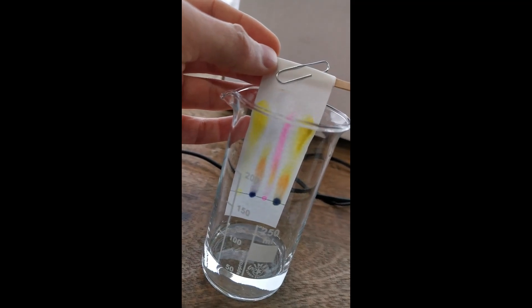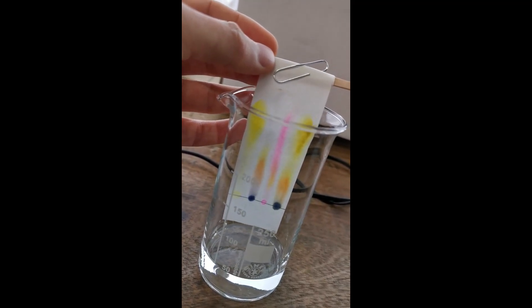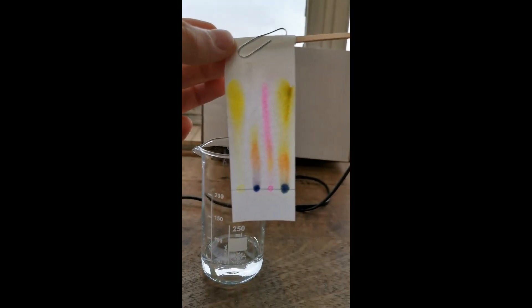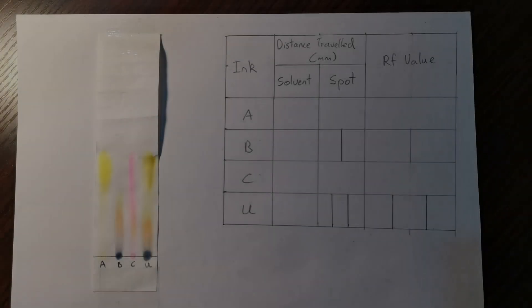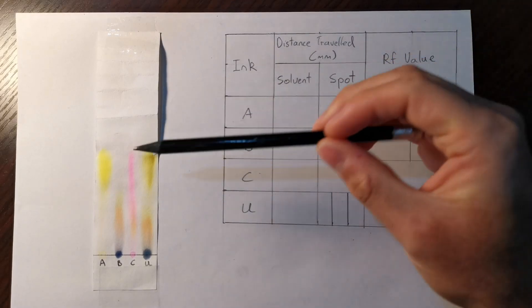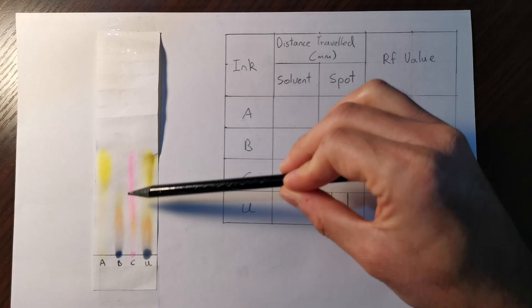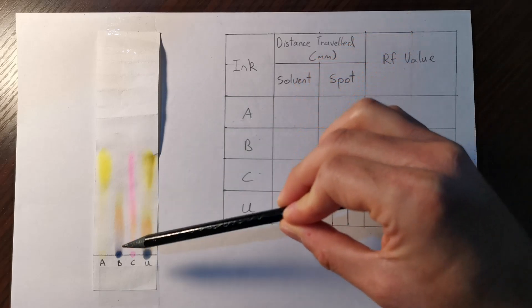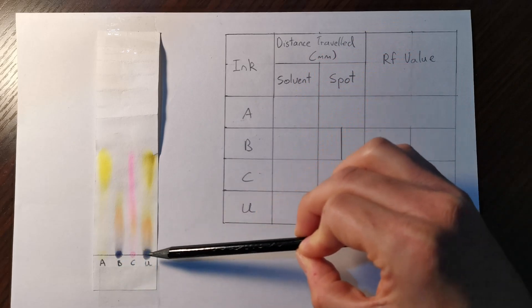When the solvent reaches close to the top of the chromatography paper, you remove it from the solvent and let it dry. Now we're going to fill out a table. Here you can see the chromatogram where I've separated the four inks.